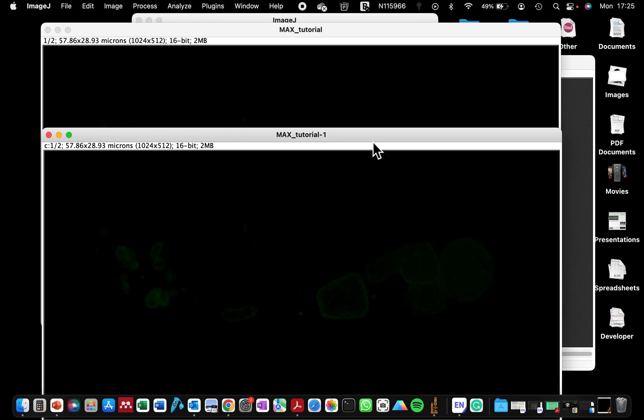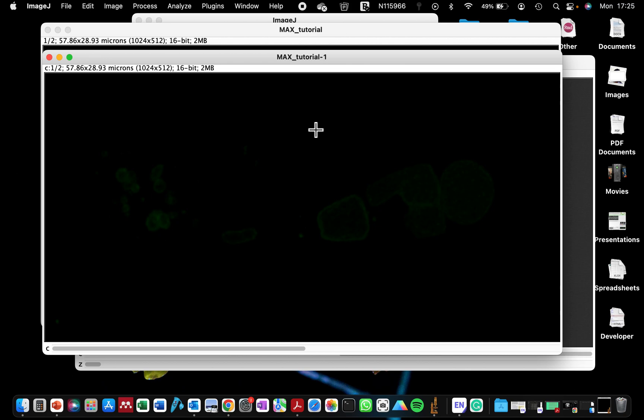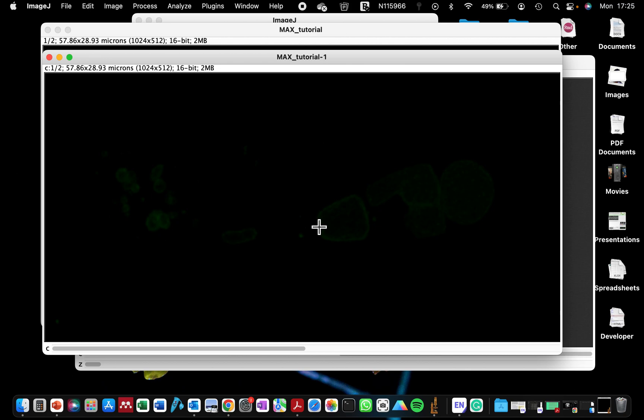Next, I'm going to increase the brightness of this fluorescence image that is barely visible. I don't know why ImageJ always does that. On the microscope it was very bright.